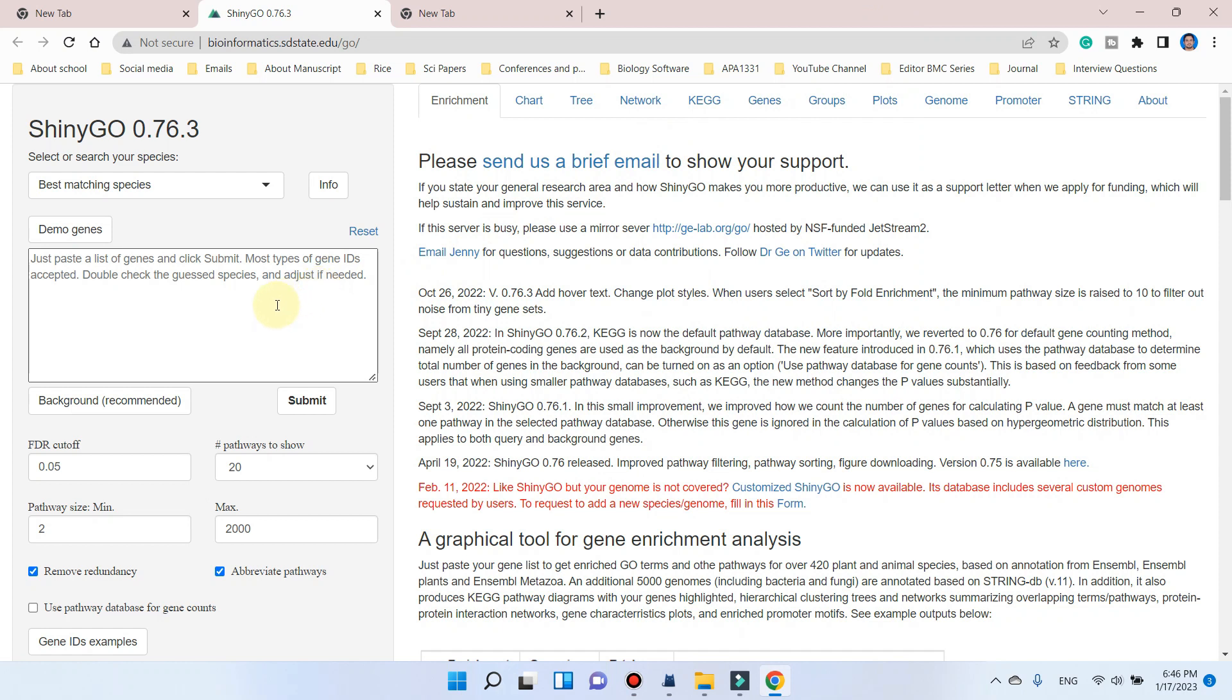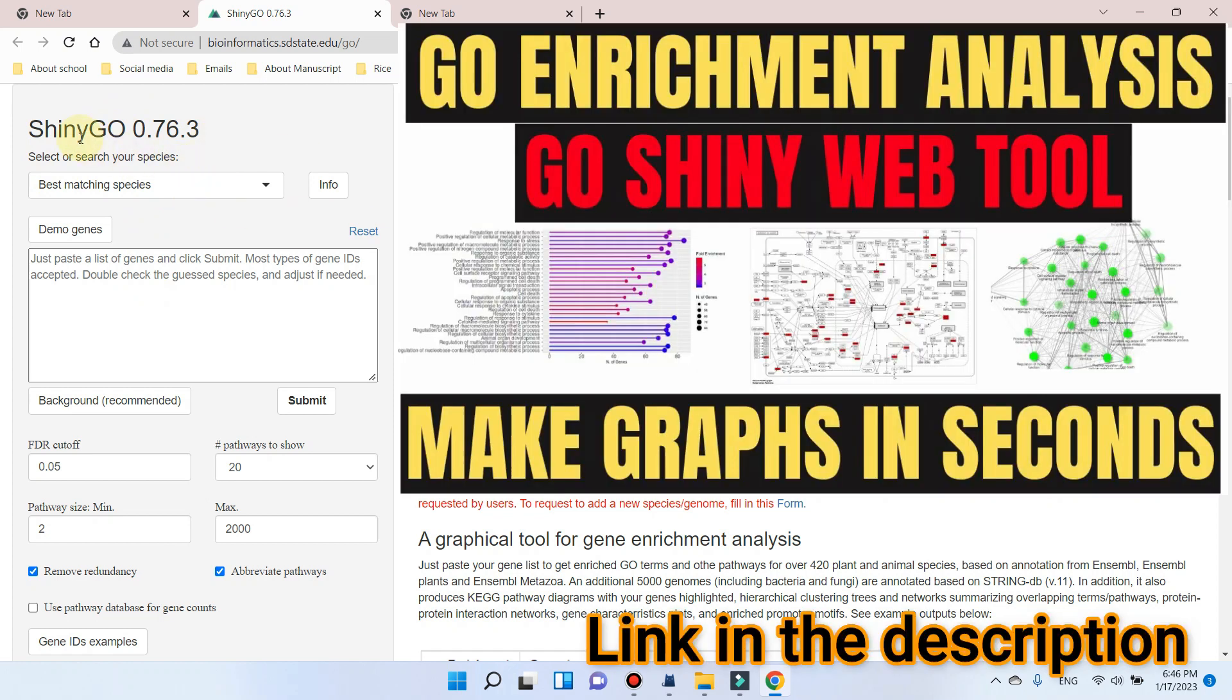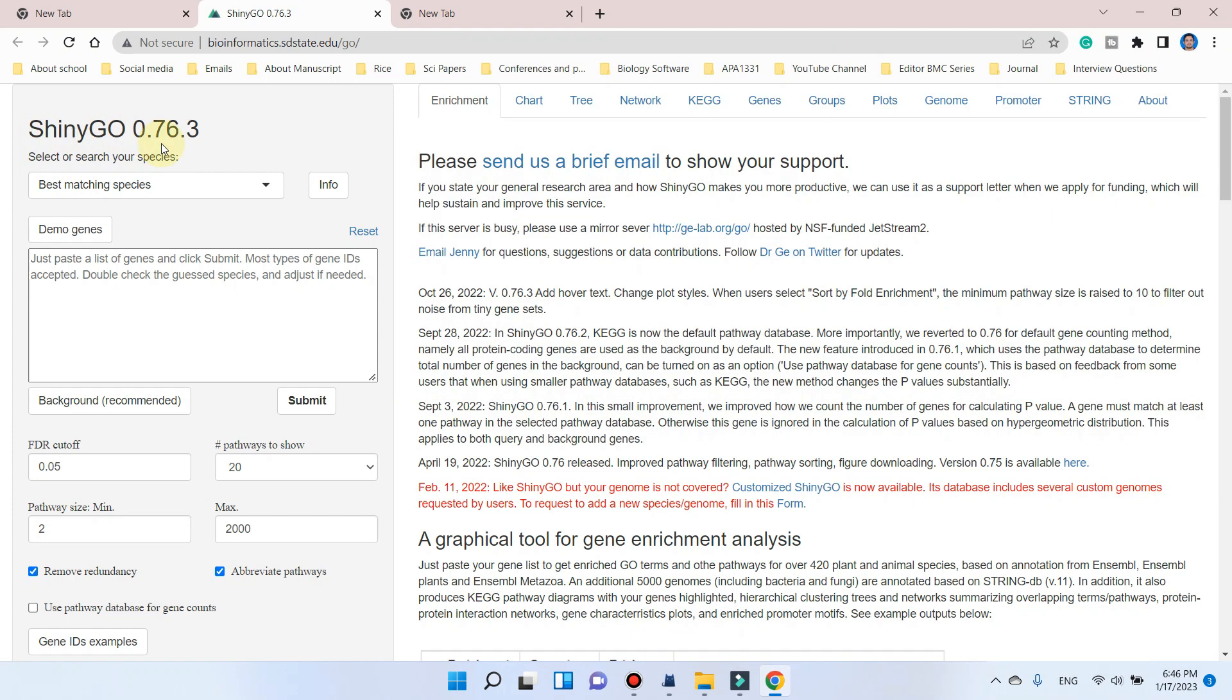Welcome to another video tutorial. In this video, I will tell you how we can resolve the problem of ID recognition while using the ShinyGO tool. As in my previous video, I have already made a tutorial about how we can use this ShinyGO tool for gene enrichment analysis, but most of the students are facing the ID recognition problem.